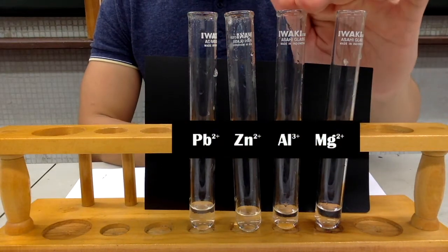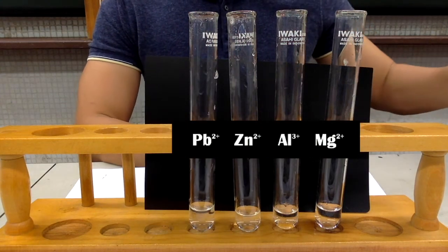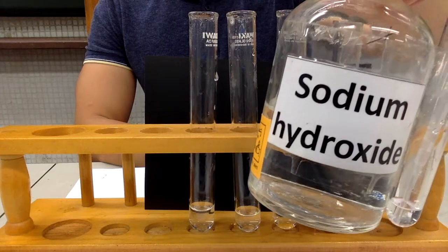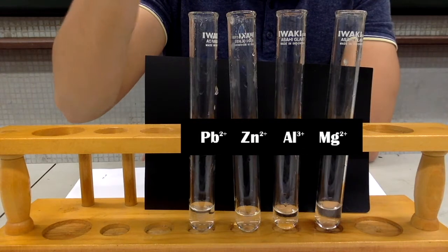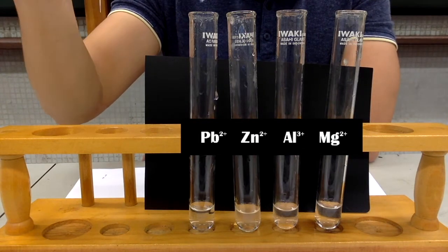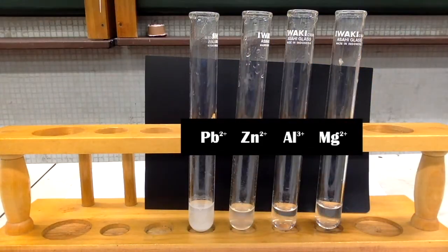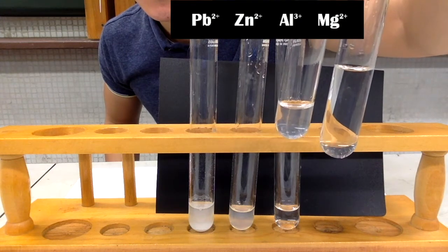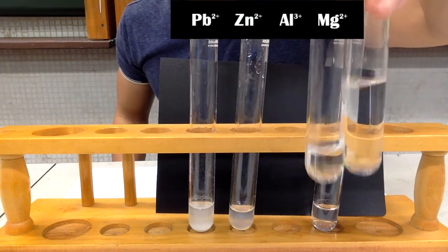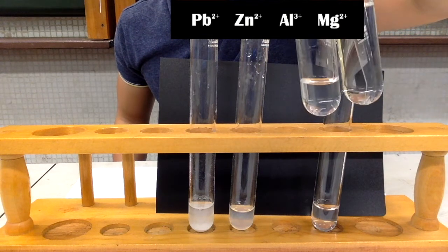Aqueous solutions of magnesium ion, aluminum ion, zinc ion, and lead 2 ion are prepared. To each of the samples, add a few drops of dilute sodium hydroxide solution. Observe the resulting solution and see whether precipitate has formed. If you are not sure about whether precipitate has formed or not, you can compare it with tap water. White precipitate is formed in all 4 samples.